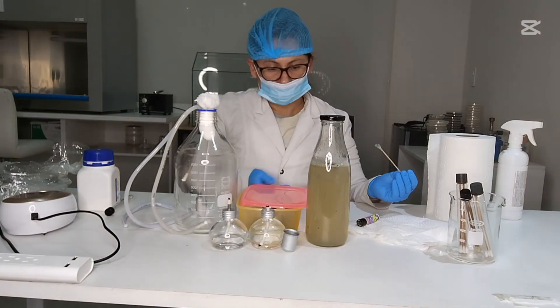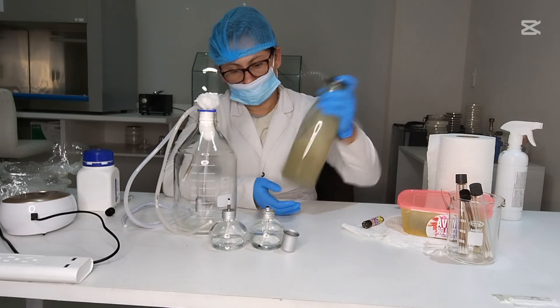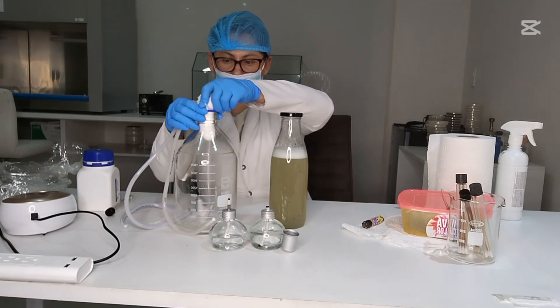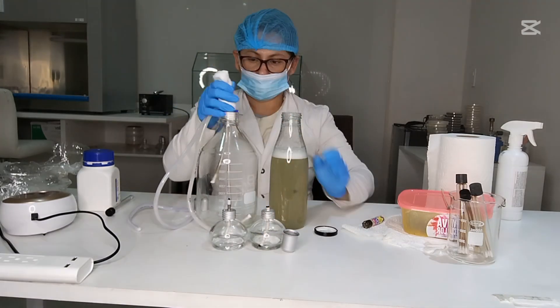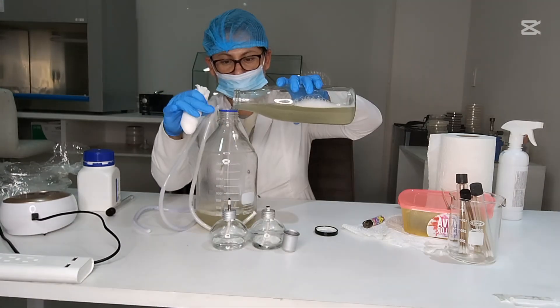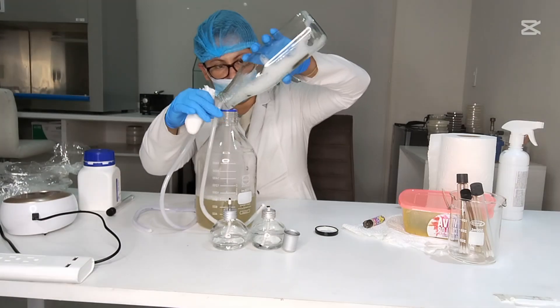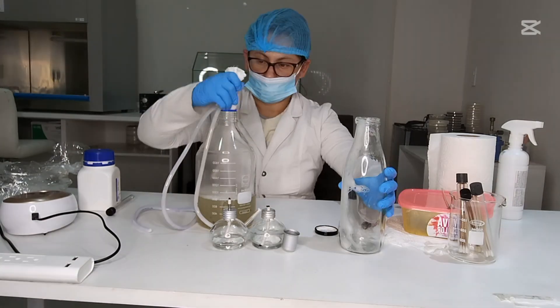Aerate and monitor: turn on the air pump and maintain a gentle bubbling to supply oxygen. Keep the bioreactor at a stable temperature suitable for your microbe, usually 25 to 30 degrees Celsius. Monitor pH if necessary and adjust with food-grade acids like lemon juice, or bases like baking soda.